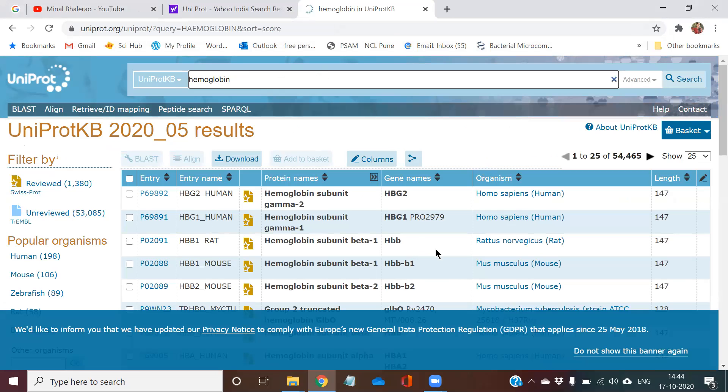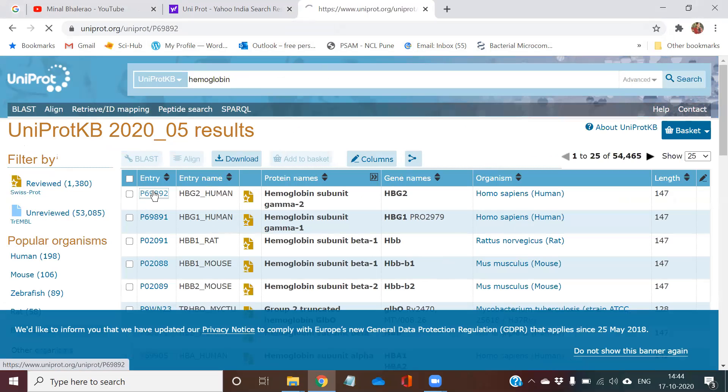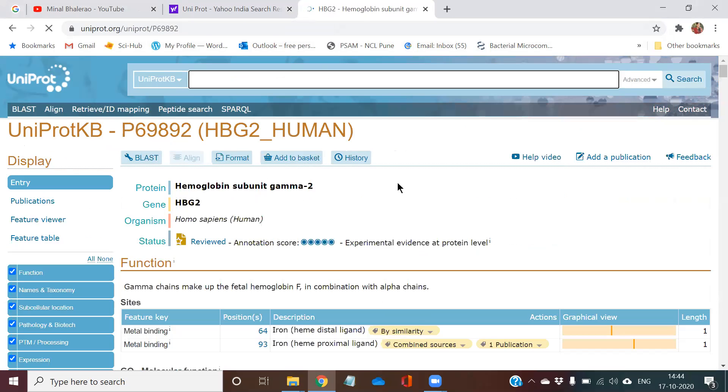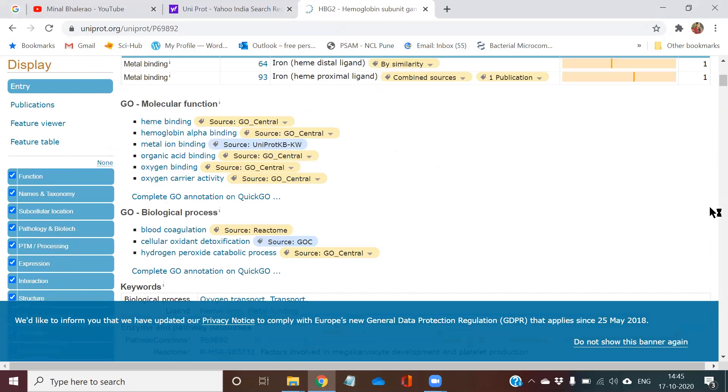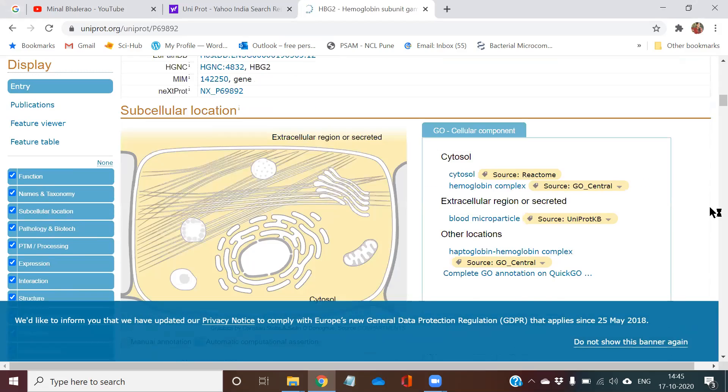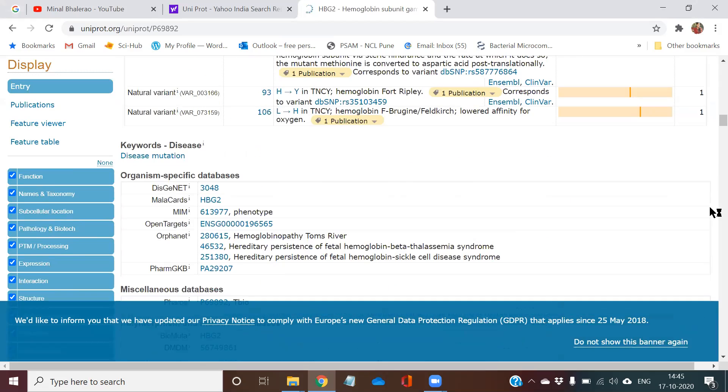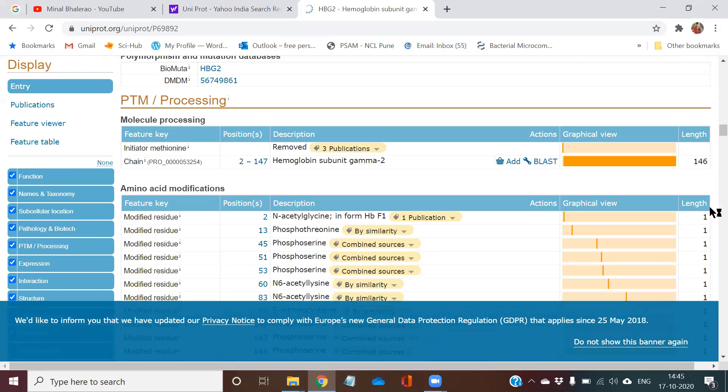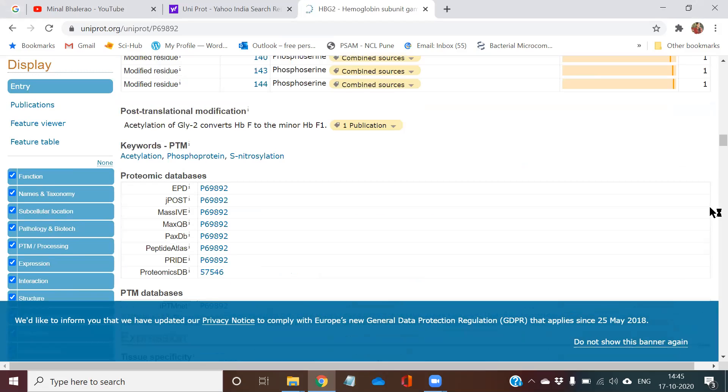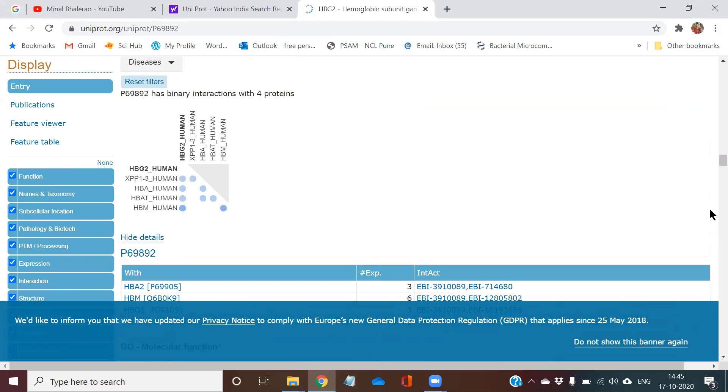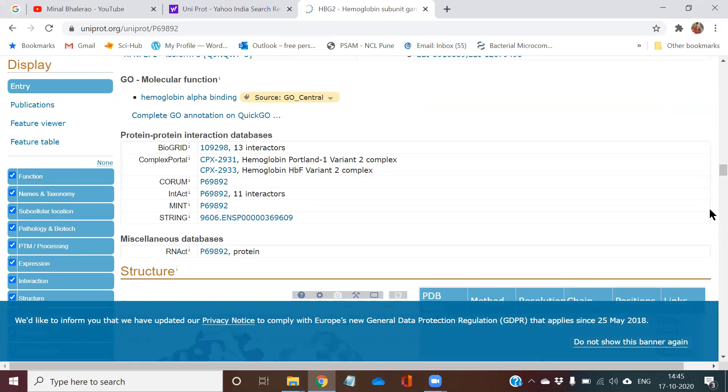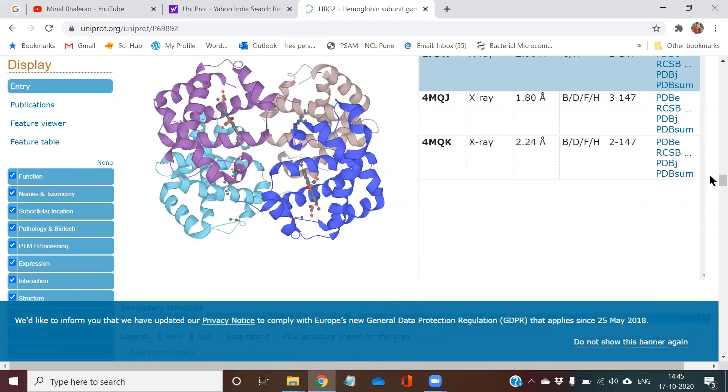Now you have got a set of names here. So the first entry I am clicking on in the UniProt site. In this site, you have to scroll down. You can see a lot of information about the hemoglobin protein. You can take whichever information you require from this site.